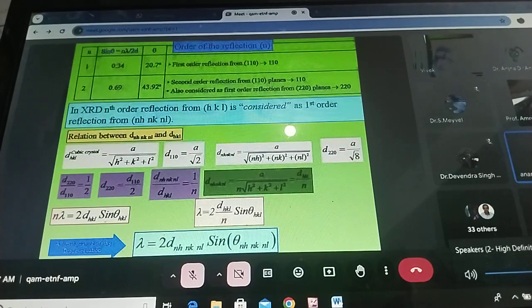Yes, sir. It's clear. Whatever I do, the program will take the atomic scattering factor of that molecule only. Yeah, now I understand. I have one more question.